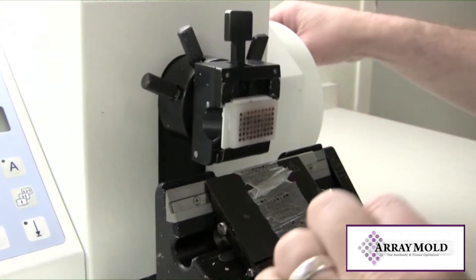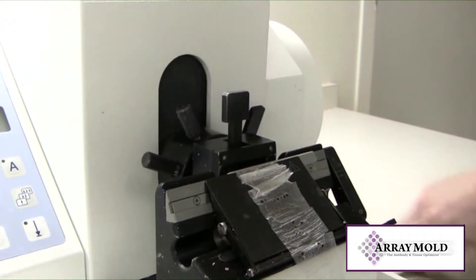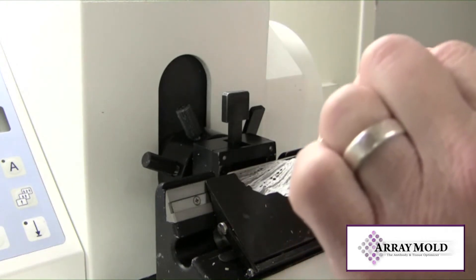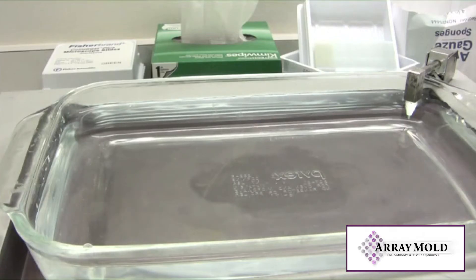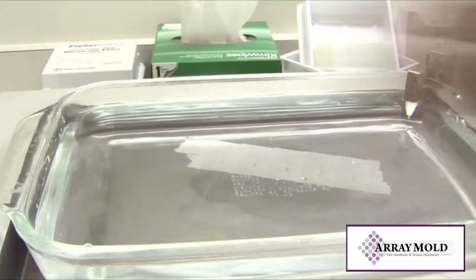You can see in the tissue ribbon that some of the punch cores are missing. Actually, they have curled. This is common when cutting an array block. When you lay the ribbon on a water bath, they usually flatten out.